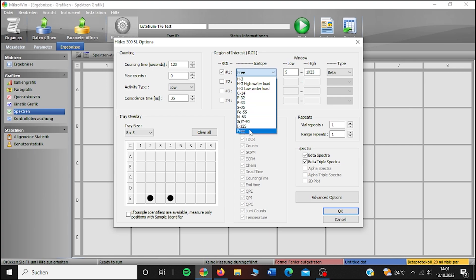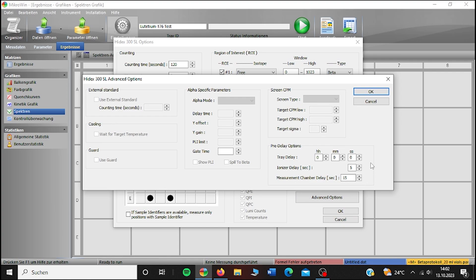For type, it's beta, you get the beta counts, and for beta triple, you get the triple coincidences separately. There are 1023 measurement channels, and it will automatically correct the number if you accidentally enter too many. Under advanced options, you will find the tray delay, which is how long the tray sits in the dark without being measured to let photoluminescence decay. 15 minutes is sufficient.